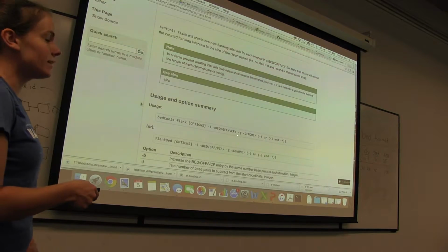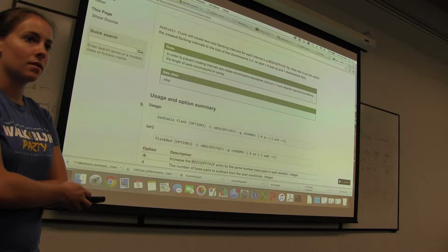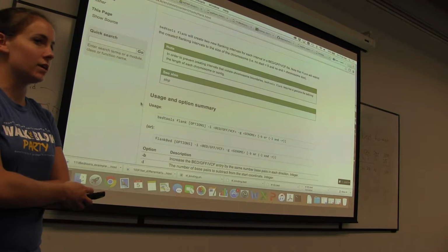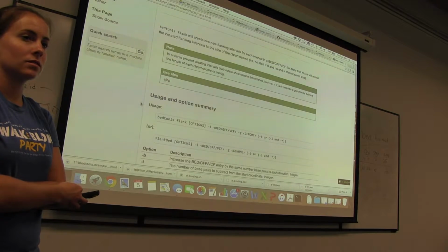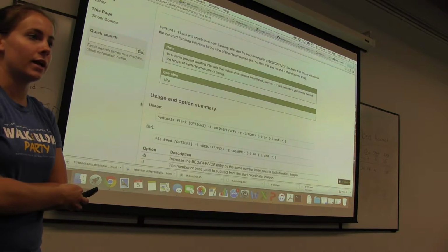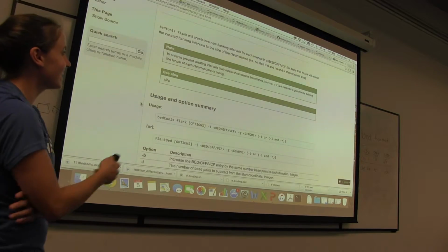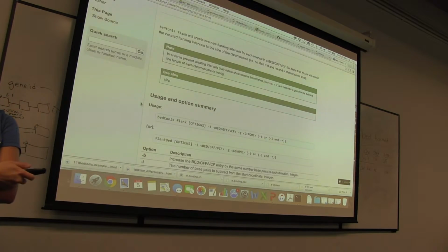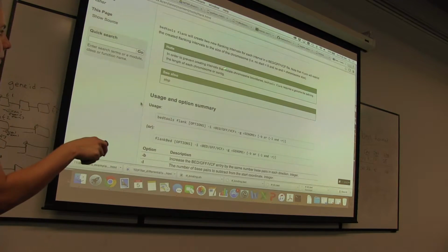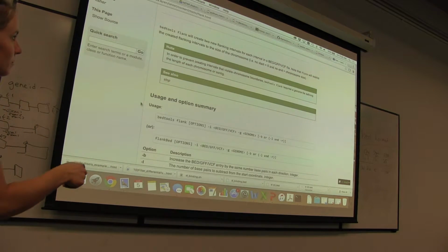Okay. What are you guys giving it for the genome? HG19, just like those four letters, or hg19. Okay, and how did you know that that was the one that you needed to use? Because I put it in there. Okay, so some people were getting confused and saying, oh, genome, that sounds familiar, I'm going to provide it the genome annotation that we had. And a lot of times whenever it has these flags, it'll give you more information about what you need to input in there.